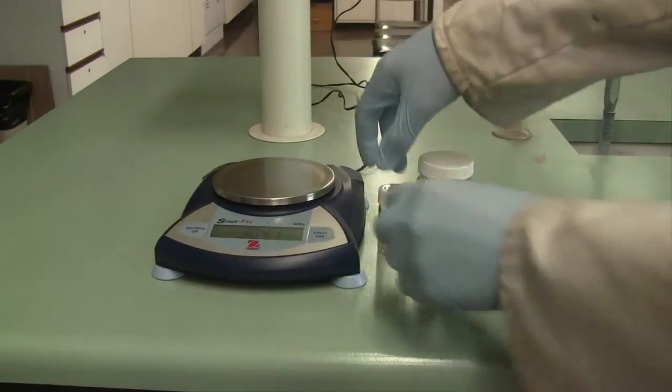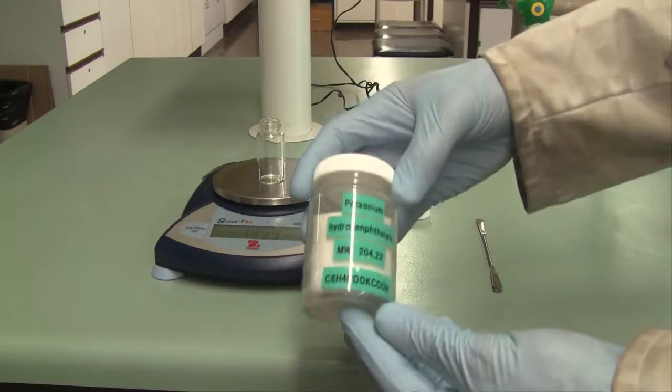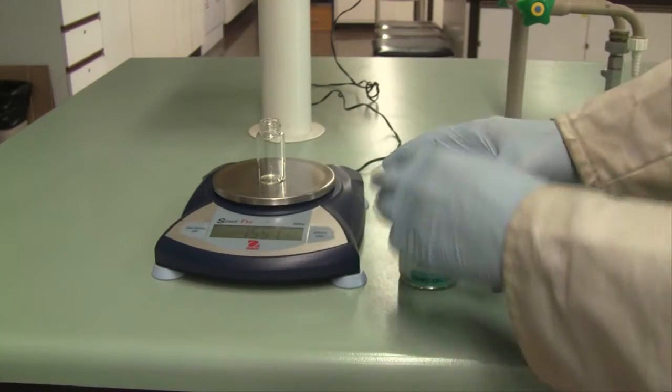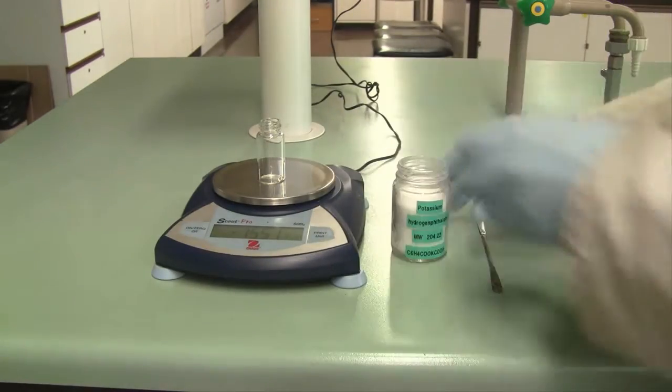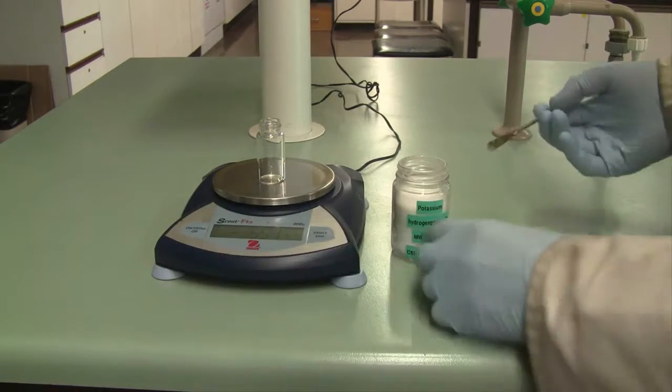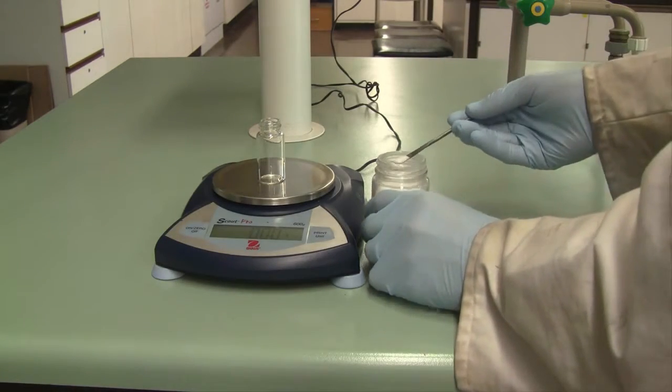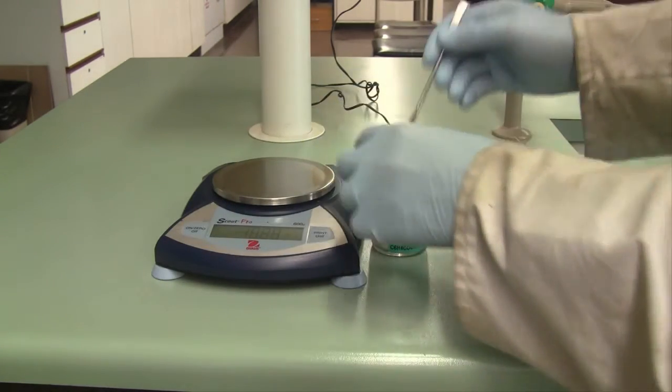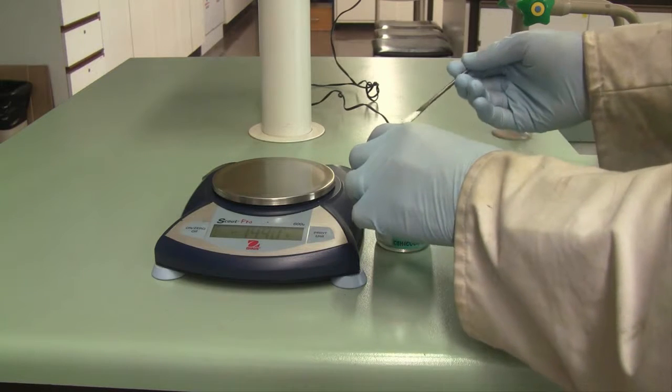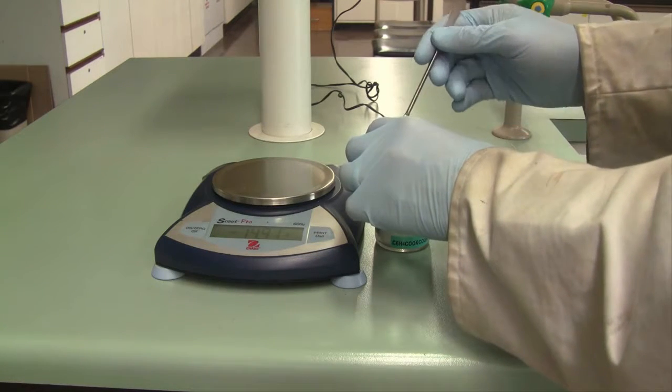Next we'll be preparing the acid solution for titration. We'll be preparing a solution of potassium hydrogen phthalate. Using a top loading balance, weigh out approximately 0.4 grams of the solid. It doesn't have to be exactly 0.4 grams, and you don't need to know the exact mass that you're adding here. We'll measure the mass accurately by weighing by difference.